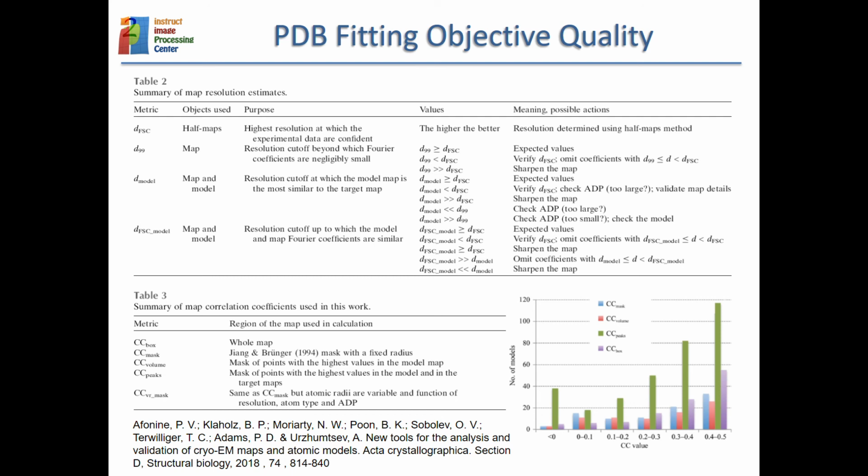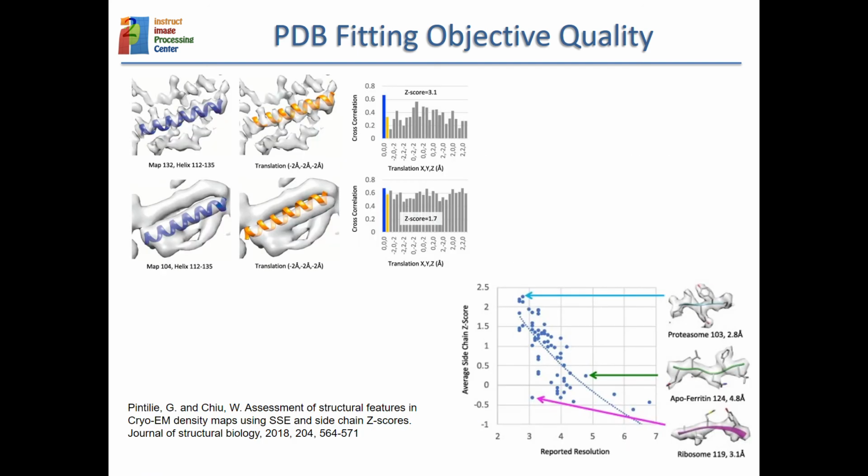So there are many different things that you can look at to make sure that the atomic model is supported by the cryo-EM. And here is another one. This is MapQ. MapQ is comparing how visible your different atoms are in the 3D structure.